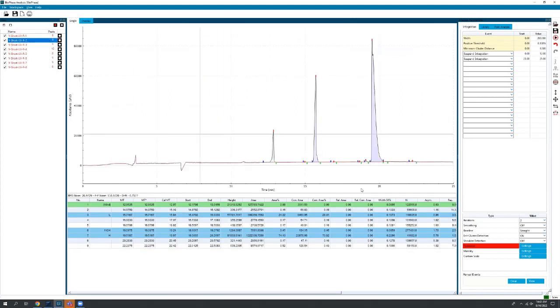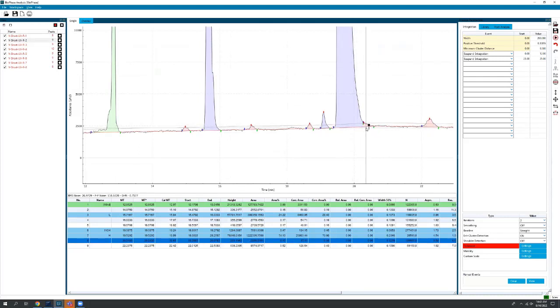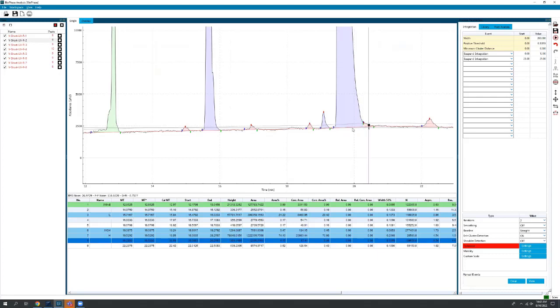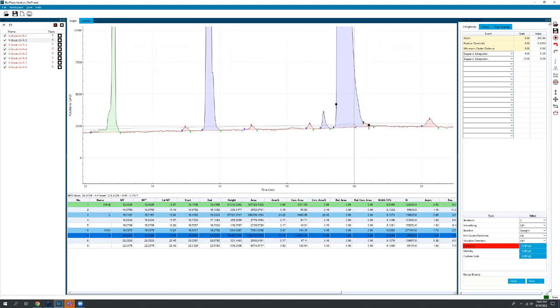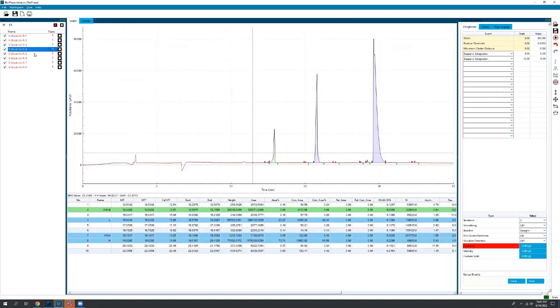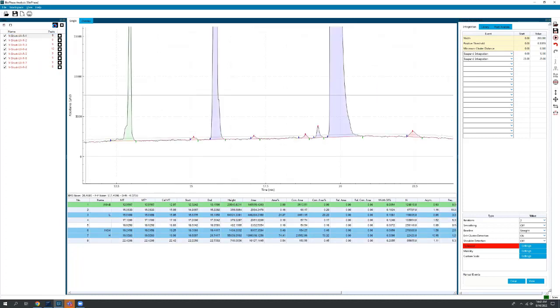We have this one at 8 peaks, this one's at 9 peaks. If we zoom in, we can see that this peak is still split out for that sample. Really not a big deal. If we look at it, the corrected area percentage is about 0.16, so very, very minimal. But if we want to, we can just go ahead and merge those peaks back together, and take a look through how it did for all of our samples. We can also click this button here and bring them all into an overlay.